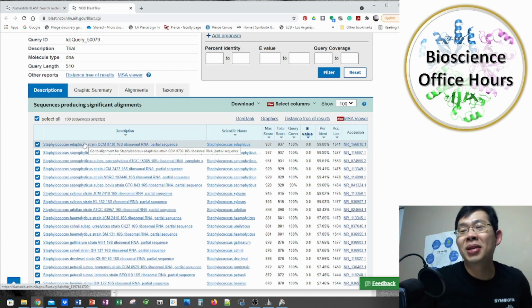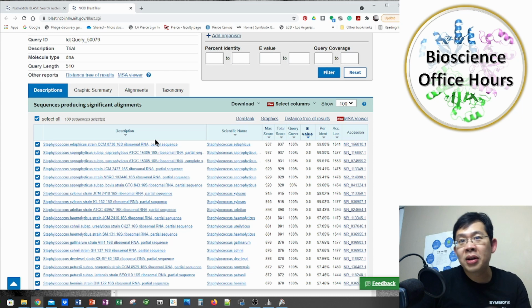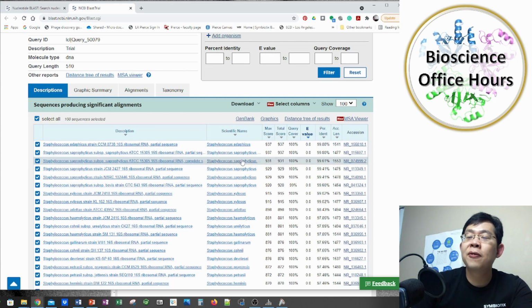Okay, that's pretty much what you can do. But here in this lecture series, I'm going to show you what some of the numbers mean, what they represent, and how you can be very confident that this is truly the identity of your organism.